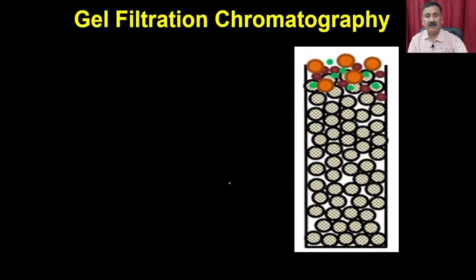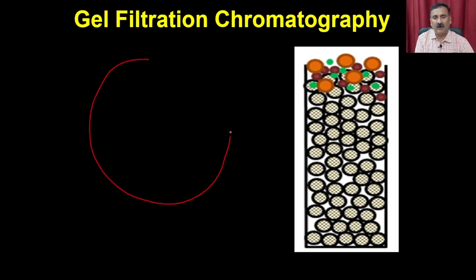To understand this better, I'm going to show you what a bead looks like. In a small bead, you are going to have pores like this.